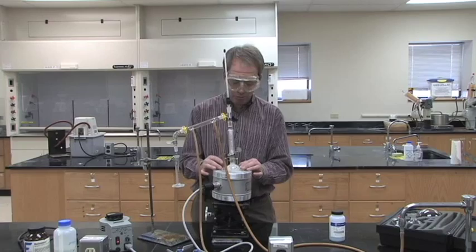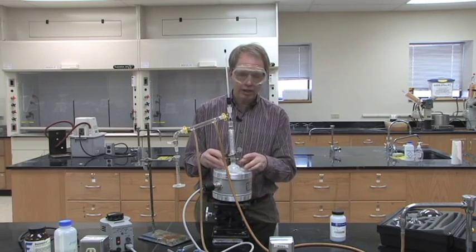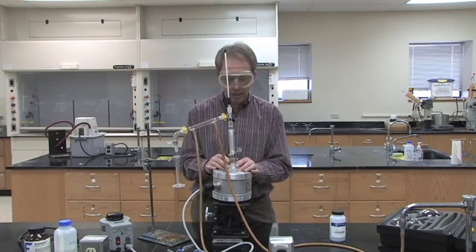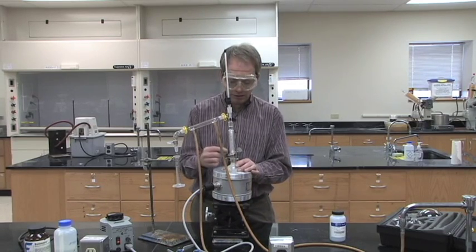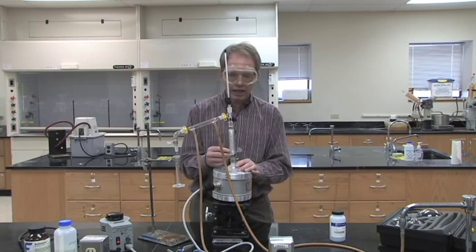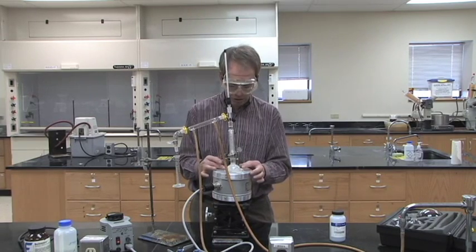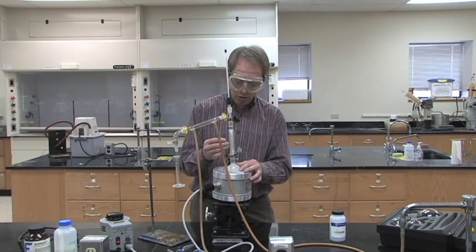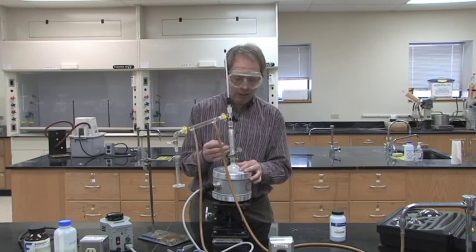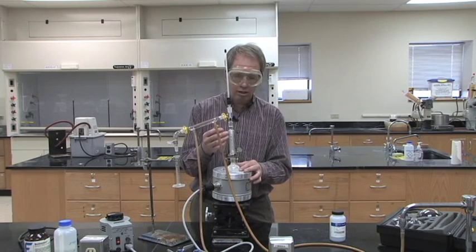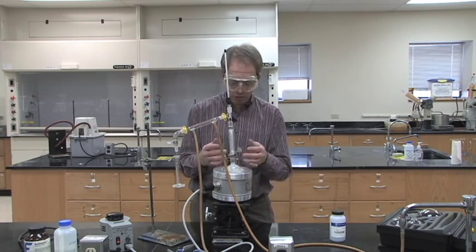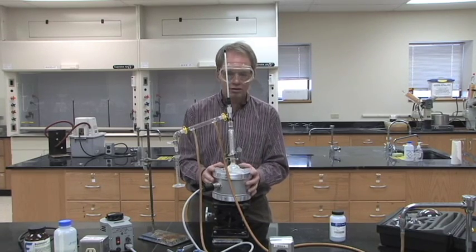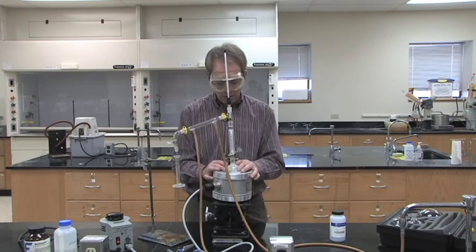What happens is they both start to boil in the beginning, and the lower boiling compound will have more of it enter the vapor phase and go into the condenser where we have the glass beads. It'll hit the cold glass beads and drip back down into the solution and be heated up again to the vapor phase. The lower boiling compound will go through the glass beads more than the higher boiling compound, which will hit the cold glass beads and drip back down into the solution.